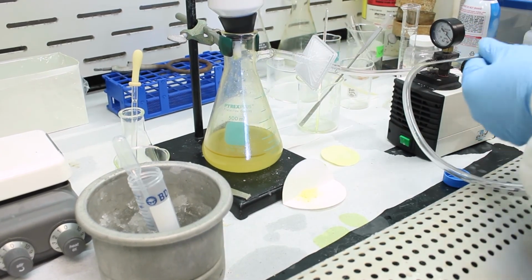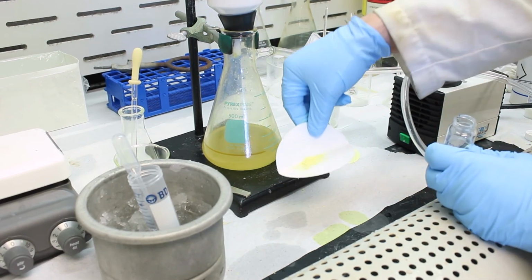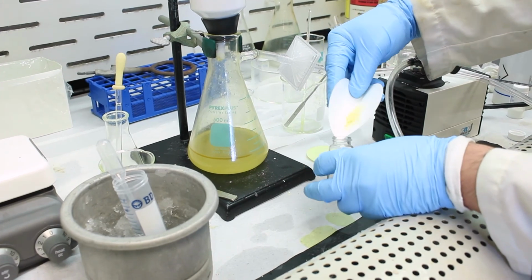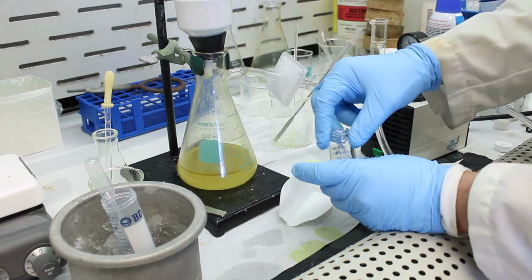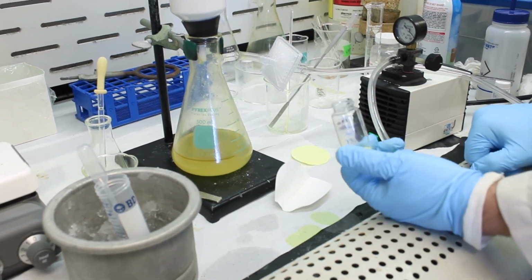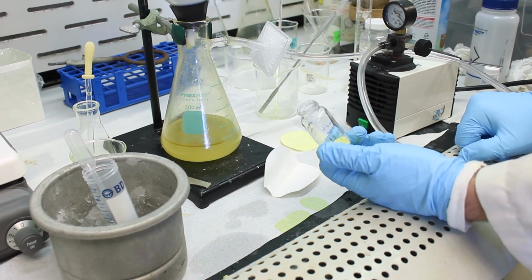All right, that's all we're going to get from the filter. So that's all. It'll probably be a very low yield. That's it. So we'll place this in a desiccator for just a little bit. There's very little water probably in here, and then we'll get a yield.